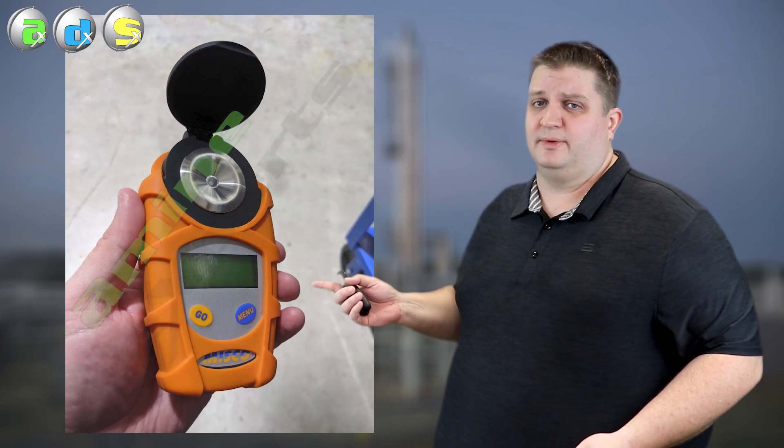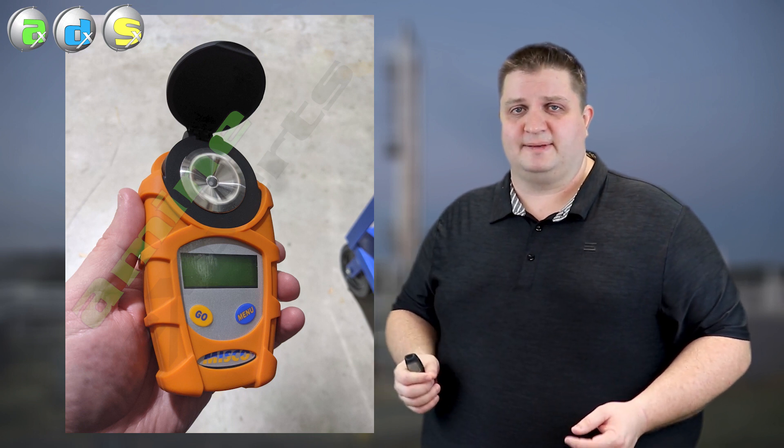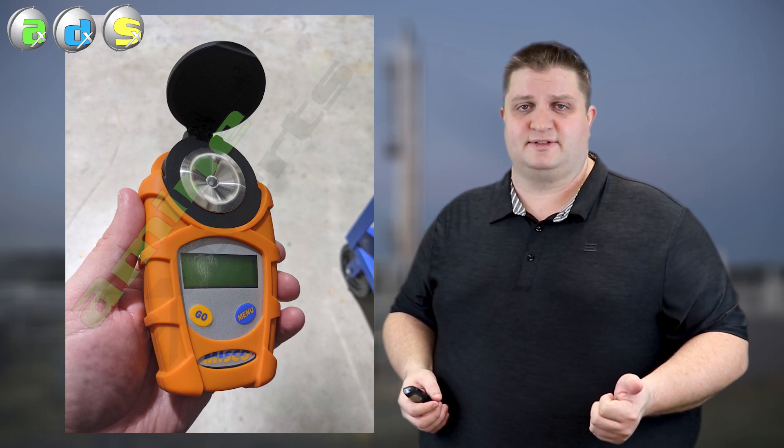Now that we've gone over the different ways we can look at the amine sample and what it means, the second most important test that's done on site is the amine strength. This is typically done through a titration method inside the lab through a procedure provided by your vendor. An alternative to that that we have found is the use of one of these. This is a digital refractometer. These are actually really quite handy because you can just do it on the spot, grab a sample, put a couple drops in, get a result.